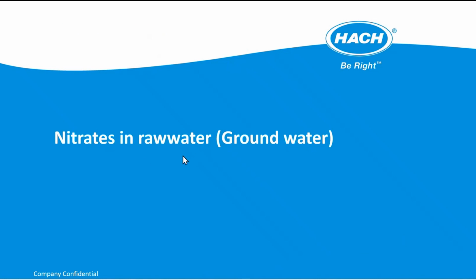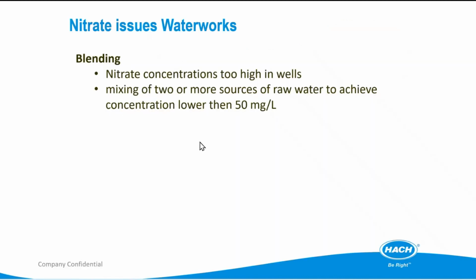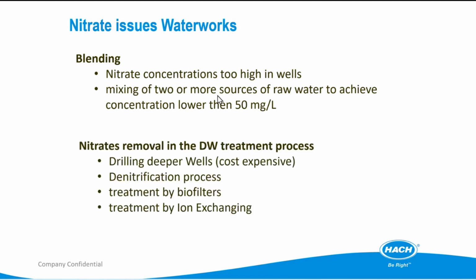Okay. Next, even with groundwater or river water, we may need to measure nitrate. I'm not sure about other countries like the Philippines or Malaysia, what the limit of nitrate content is. But in Vietnam, the limit is only 2 ppm, so maximum 2 ppm nitrate at the inlet of drinking water. So we also need to measure the nitrate content in either groundwater or river water. Especially with river water, it can be blended with salts from raw water and wastewater, so sometimes the nitrate content can be very high. So we need to measure nitrate in raw water.